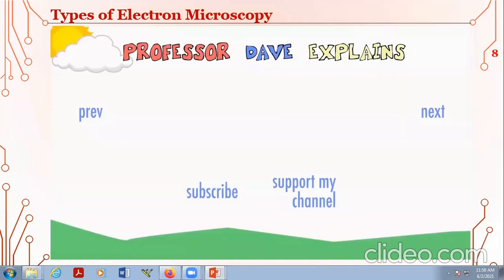So on the other hand, vacuum must be considered. Without vacuum, we cannot use the beam of electron to image or to understand the imagery through the electron microscope. On the other hand, it is the smallest level we can achieve yet, और आने वाले वक्तों में शायद पॉसिबल है कि शायद मजीद हम इससे भी छोटी चीज को डिस्कवर कर सकें.